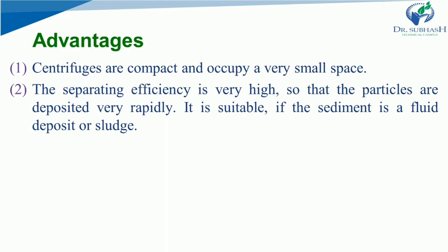It is suitable if the sediment is a fluid deposit or a sludge. You can connect the separating efficiency to ultracentrifugation, which is really important in separating very minute globule size or particle size.